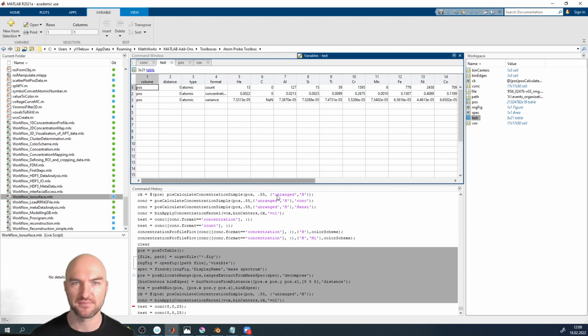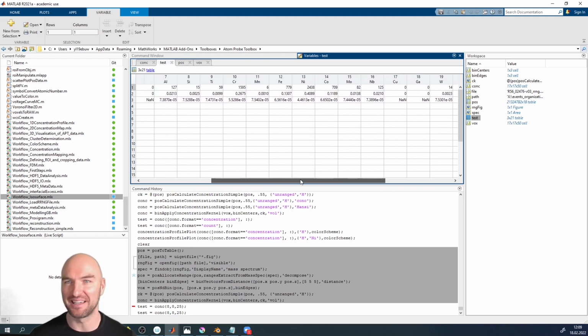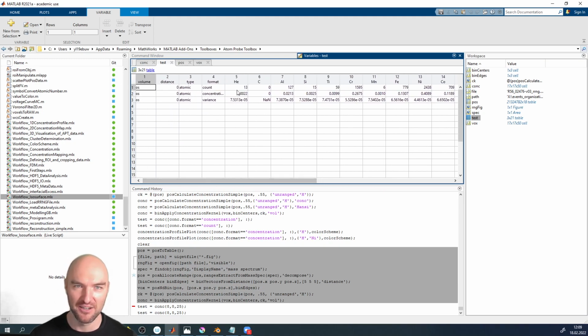In this case, I don't think I've excluded helium again. Okay, that was not a good idea. If there was hydrogen, it would say, if I got a count of this many hydrogen atoms, but the concentration is 0, because I told you to make it 0.